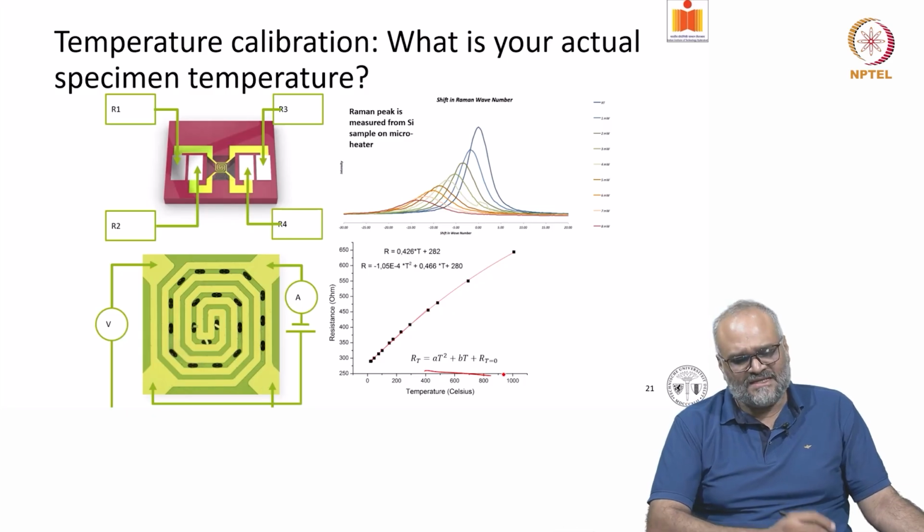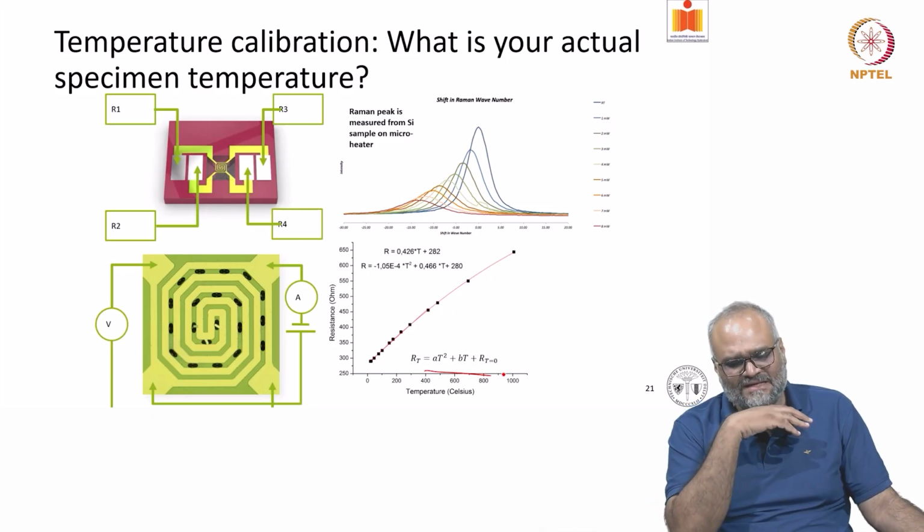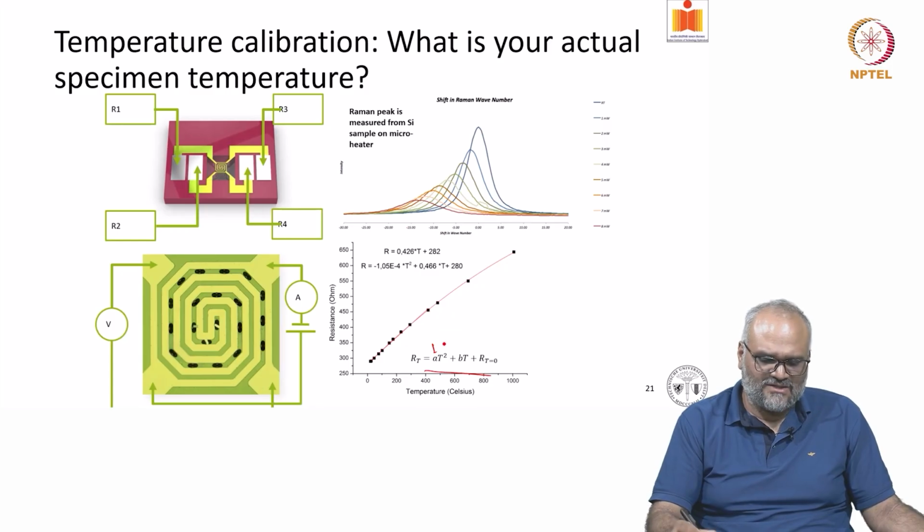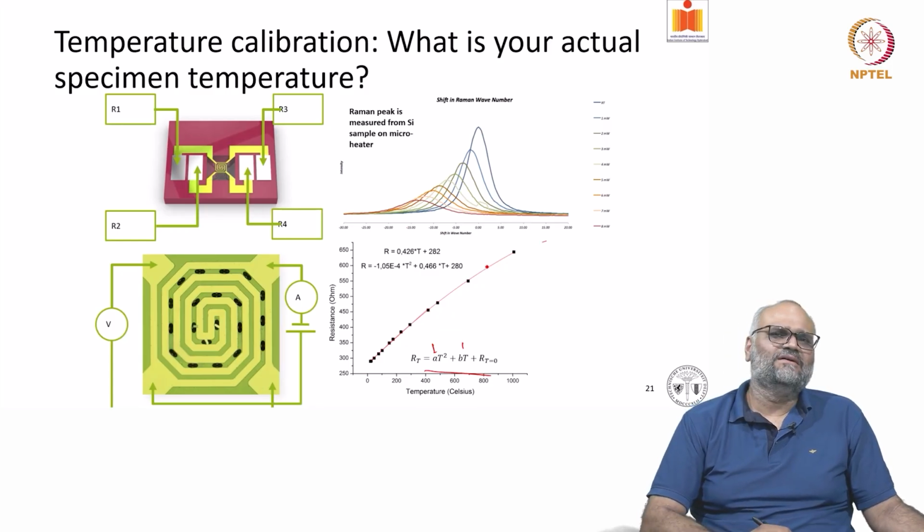So in this particular MEMS device, you have a heating control system in which you can input the parameters, entering some values for these coefficients, and you know which kind of curve this particular heater follows, and thereby you can calibrate them.